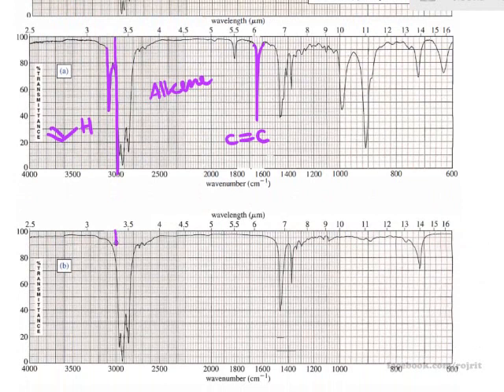First of all, mark 3000, and nothing beyond 3000, right? And nothing here as well. So this is the alkane, right? You may state that this is an alkane or an internal alkyne, because normally you cannot distinguish between an alkane and an internal alkyne.